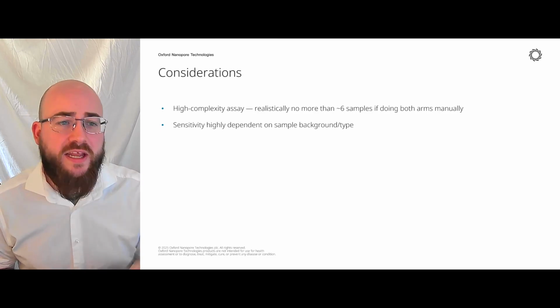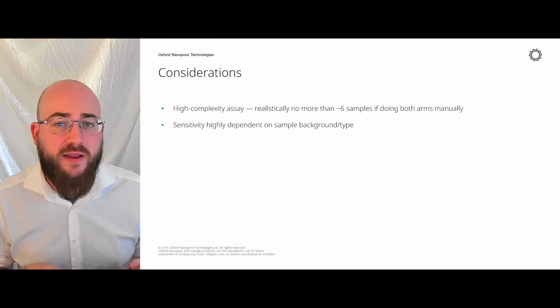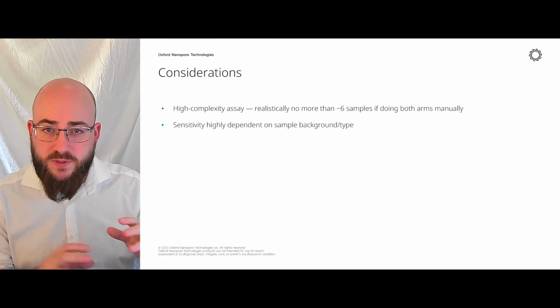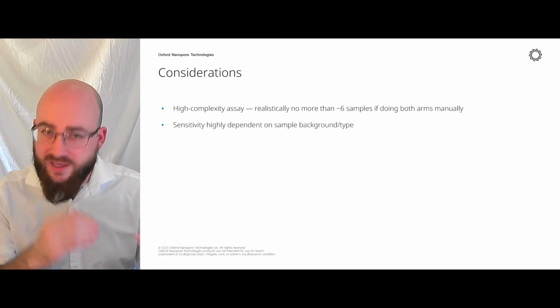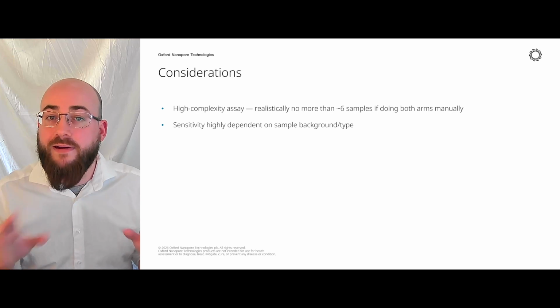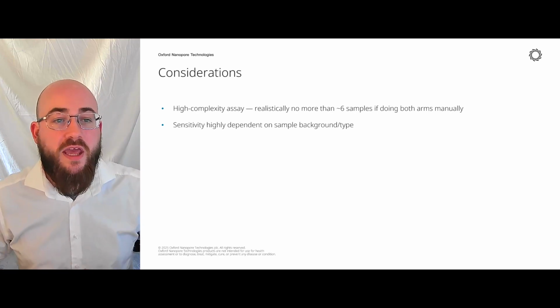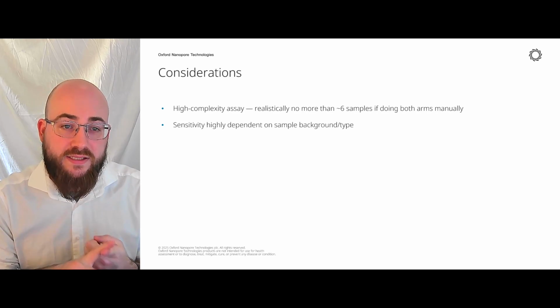We also really have to think about the sensitivity and how it's affected by the background. Like I say, those different sputum samples that I showed a couple of slides back, it's not exactly the same detection we're getting from every sample. That background's having an effect, and we need to think about how that might affect things later on in terms of what our sample is.